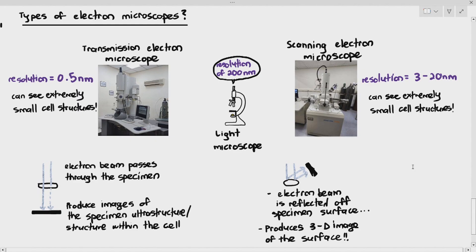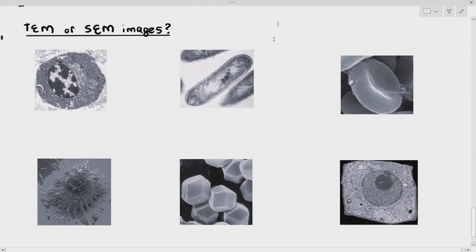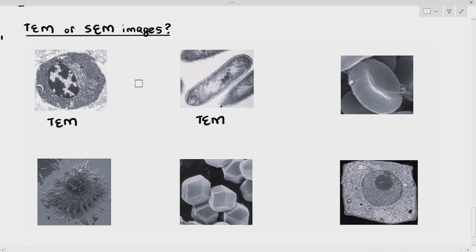Here are six images taken using the transmission or scanning electron microscope. The question is: are these TEM or SEM images? TEM means transmission electron micrograph; SEM means scanning. The first one is quite obvious — you can see the structure inside the cell, so this is a TEM. The second one is a bacterium, and you are also able to see the inside of the cell, including two lines at the border where one represents the cell wall and the inner line represents the cell surface membrane. So if you're able to see the inside, that is TEM as well.